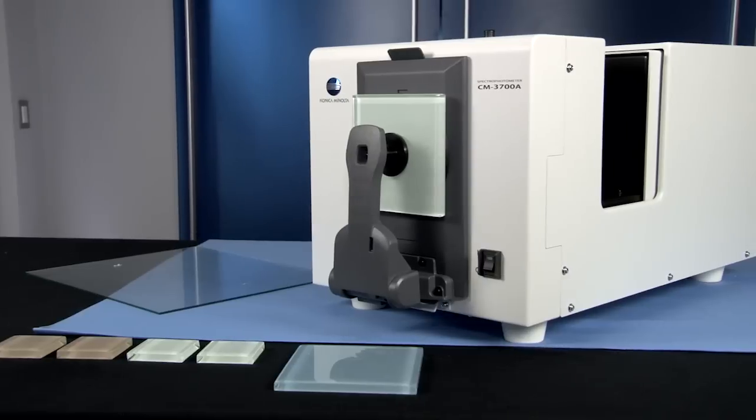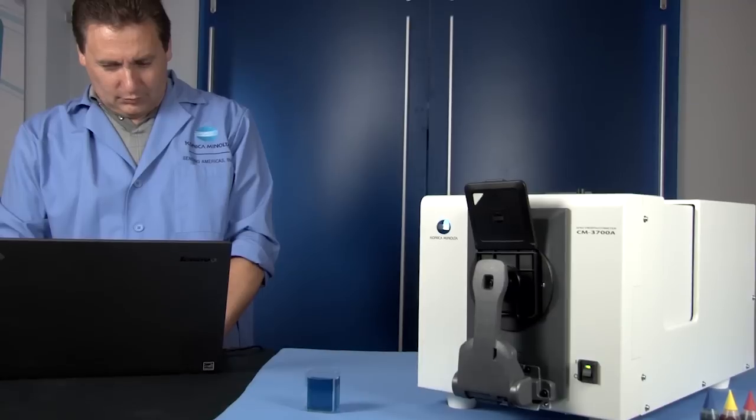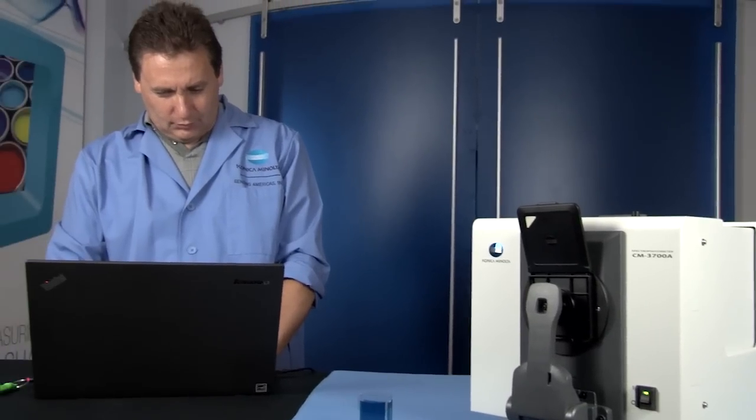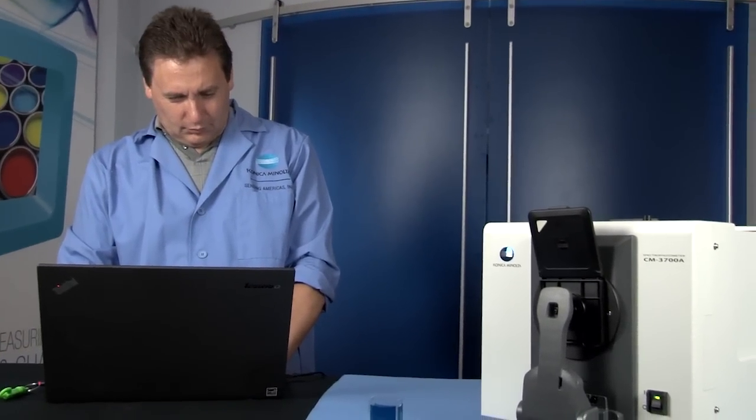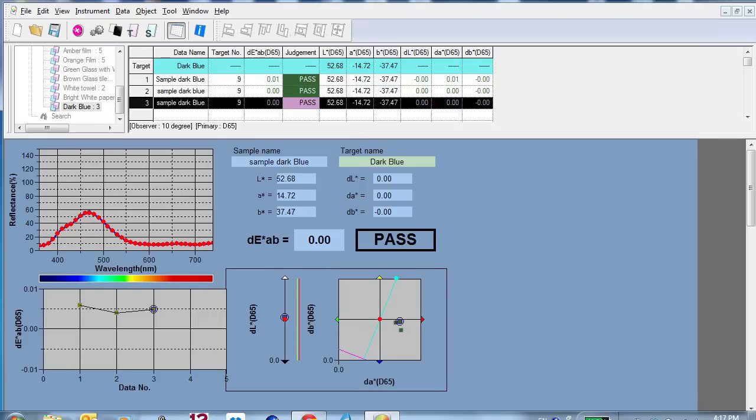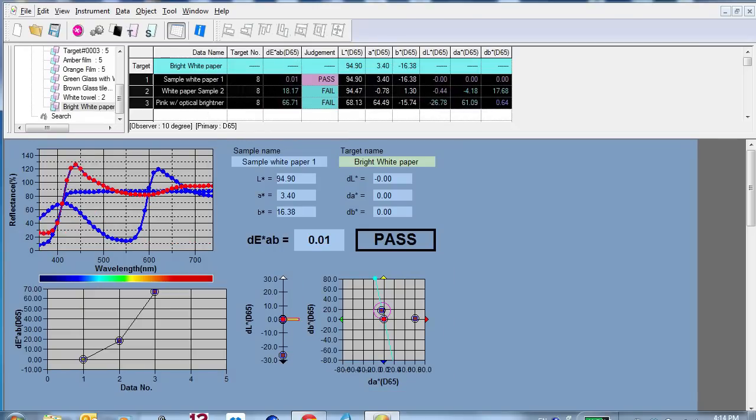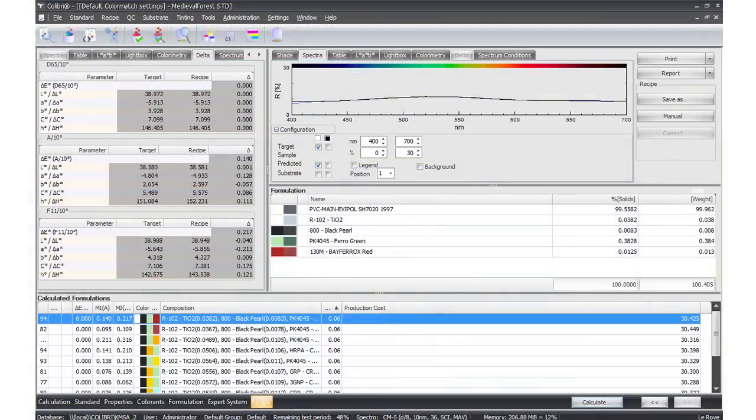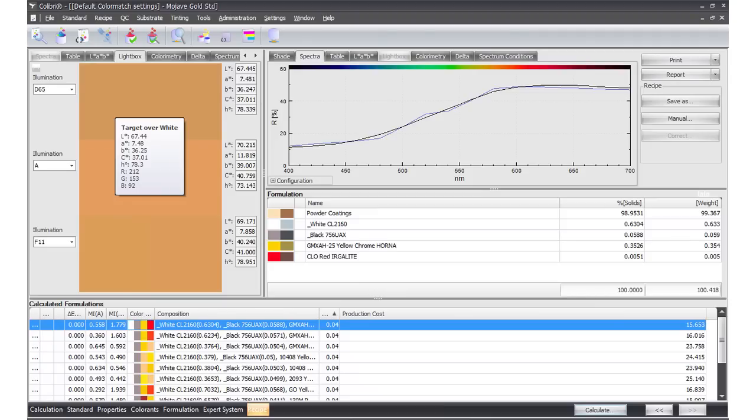The CM3700A spectrophotometer is compatible with SpectraMagic NX software, which records measurement data and provides a more comprehensive color analysis. It is also compatible with Colibri software to formulate color recipes for various applications and share real-time measurements.